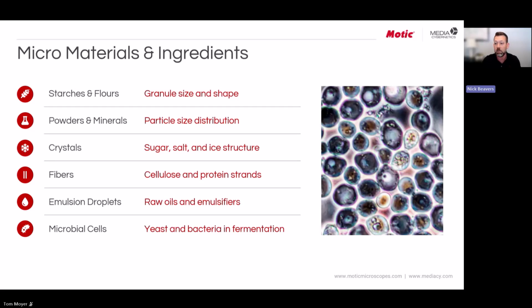All these things are going to have particular properties that are going to require, one, a different microscope at a higher magnification, most likely, but also something I'll talk about in a later slide, maybe some interest up front in thinking about how you're going to approach the entire microscopy and imaging problem before you really get started.